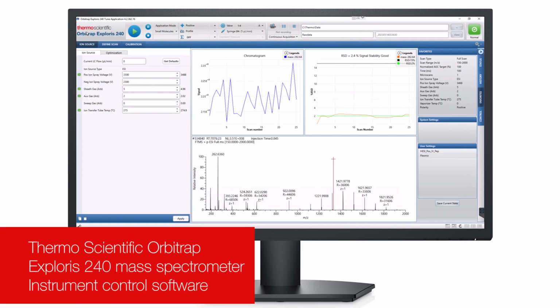Now we're going to take a look at the instrument control software. This is something that was simplified and made even more user-friendly on this generation instrument. So let's go ahead and take a look. Now we're taking a look at the instrument control software. This is for the Orbitrap Exploris 240.